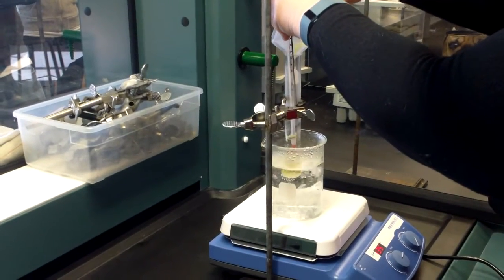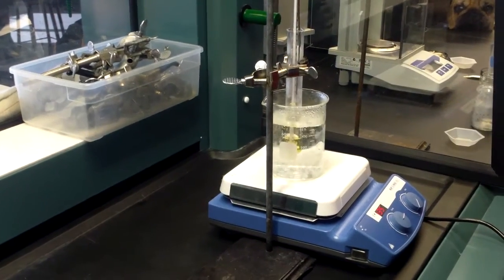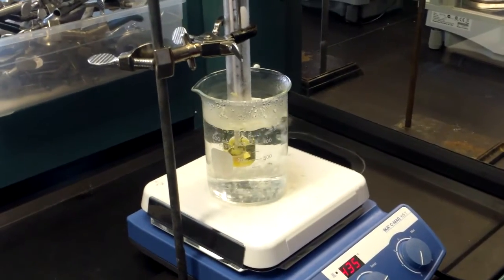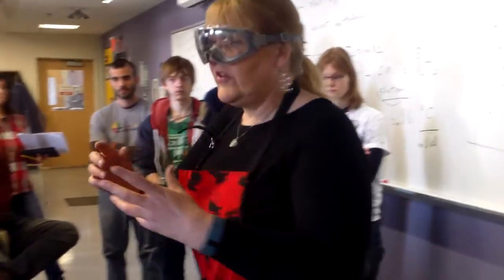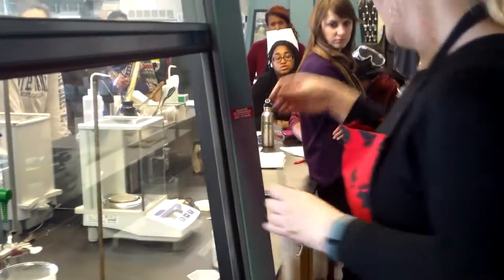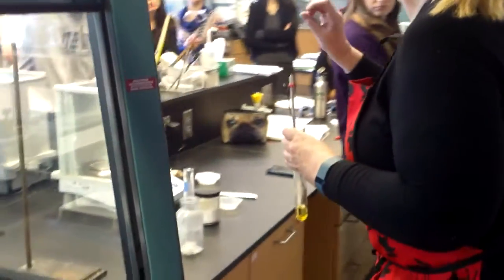Do not stir it until everything is nice and melted. We cool? Once it's nice and melted, you can stir that as well. Again, get the temperature up somewhere between 90 and 95 so that you can do exactly the same thing. Once this has all nice and melted, you're going to take it out, you're going to set it into your gas bottle, and you are going to stir while you record the temperature.